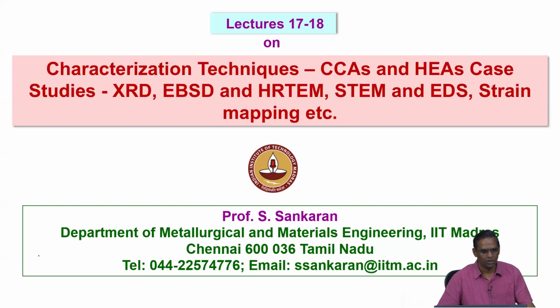And then you do some SEM and EDS for topography, secondary electron image or backscattered image, or you use phase specific diffraction techniques like EBSD. These are all phase specific diffraction techniques. Then what do we have to think about when it comes to characterization of high entropy alloys? That is the question I first want to pose before I discuss anything.